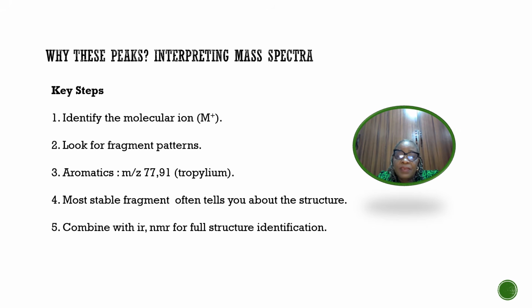Why these peaks? Interpreting the mass spectra. There are key steps. 1. You identify the molecular ion, that is the M plus ion. Look for the highest m/z value, which may be small or absent. Then you confirm the molecular weight.